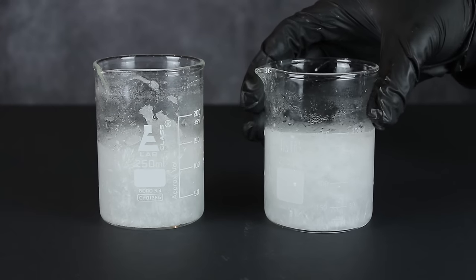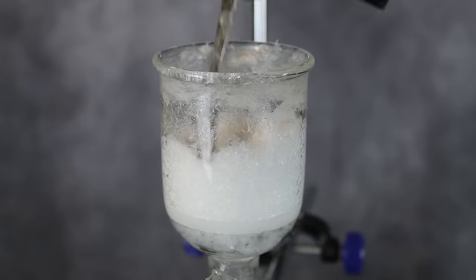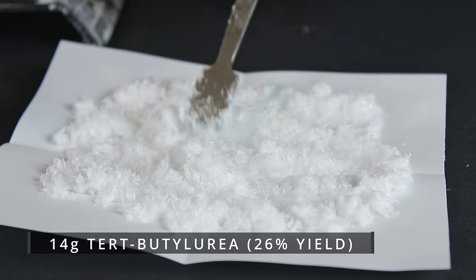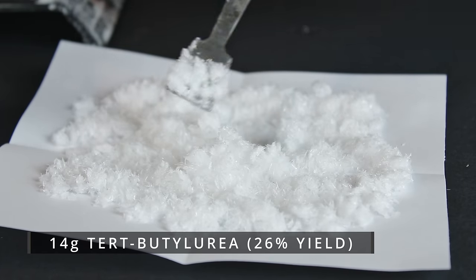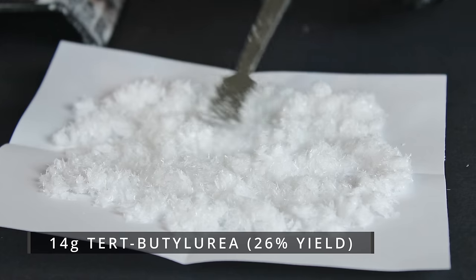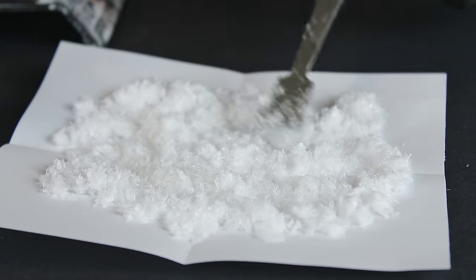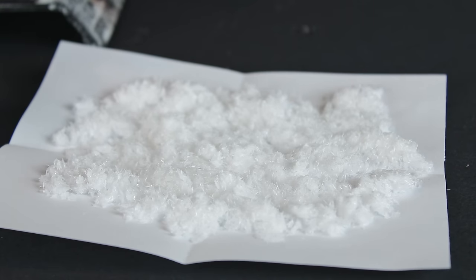After about 30 minutes, everything seemed to have crystallized, so I vacuum filtered off the solids and dried everything thoroughly on the pump. In total, I managed to produce a modest 14 grams of dry tert-butyl urea, which corresponds to a yield of about 26%. This was slightly lower than the expected 31 to 33% conversion mentioned in the paper, so no brownie points for yield. But it was still enough to move on to the tert-butylamine synthesis.